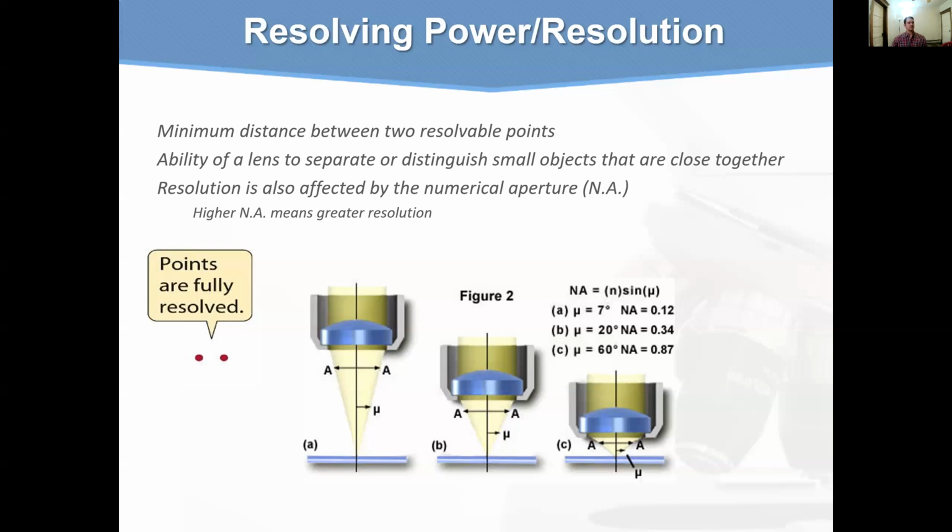Some things to keep in mind, though: the smaller the object, the more pronounced the diffraction of incident light rays will be. Higher values of numerical aperture permit increasingly oblique rays to enter the objective front lens, which produces a more highly resolved image and allows smaller structures to be visualized with higher clarity. So this all just deals with how much of the light that's being reflected by the organism you are actually able to capture and then use to distinguish the details within the organism.